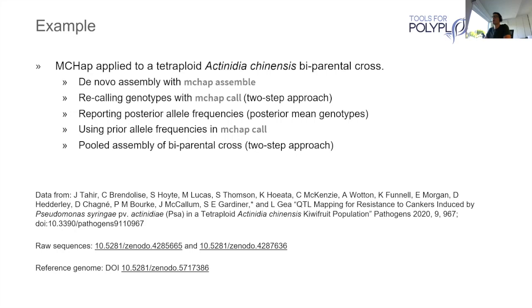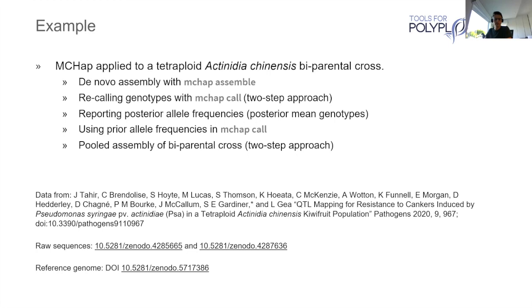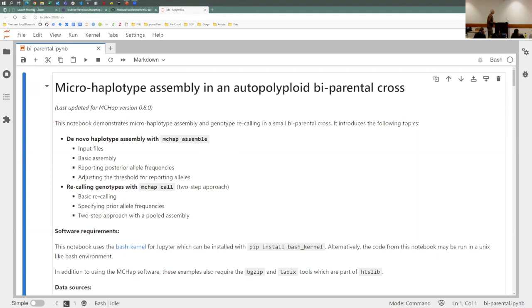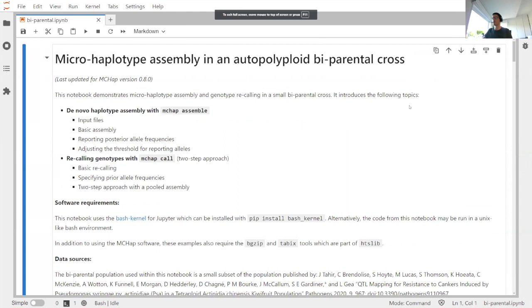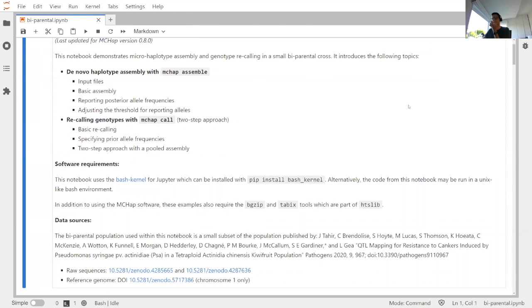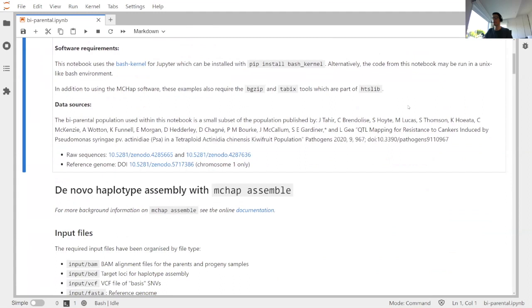I'll switch to the example now. This is based on real data — a published dataset, or a very small subset of one. The example works through de novo assembly using MCHAP assemble, looking at options with that, and then recalling genotypes using MCHAP call, which I refer to as the two-step approach, along with features like the pooled assembly. This is a Jupyter notebook — all the code is bash code, so you can run it with the bash kernel or in a Unix-like terminal shell.